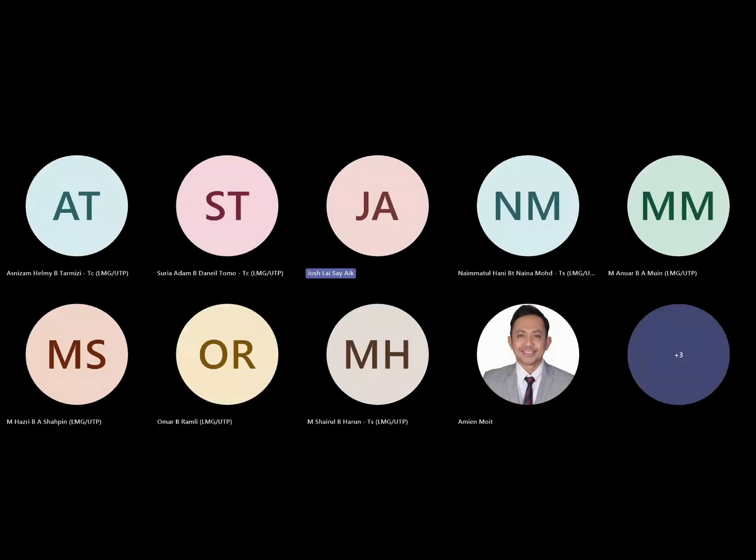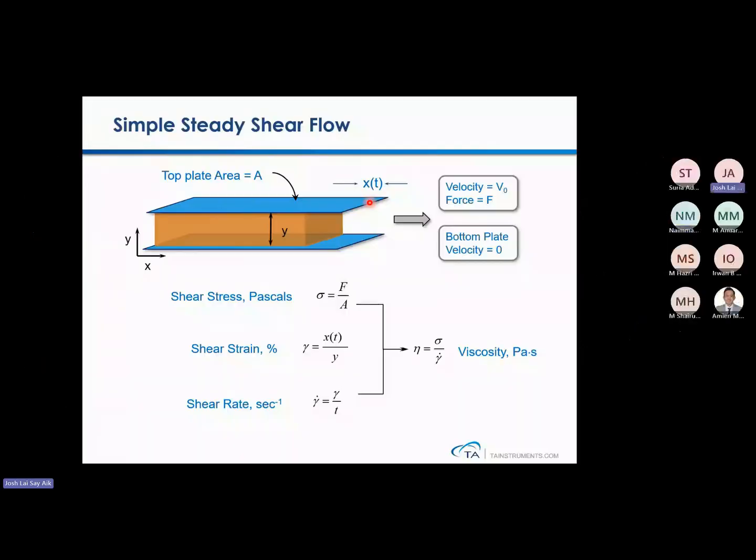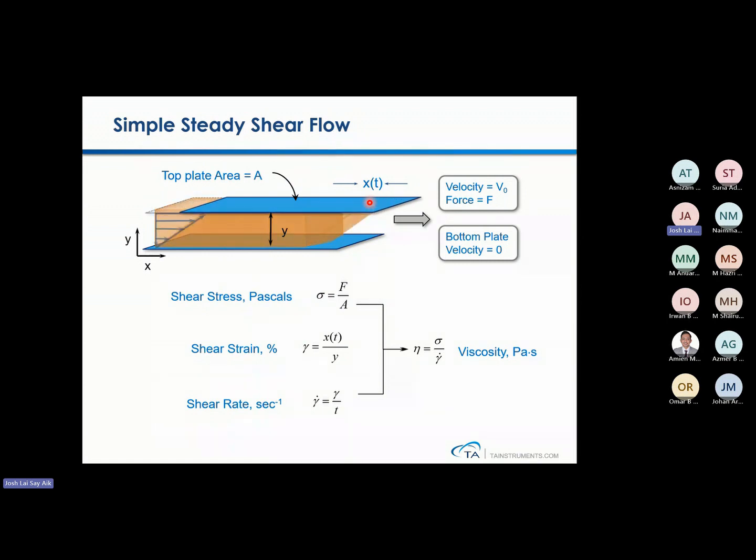If you are an experienced user of rheometers, you always have a very specific geometry size, like 8 mm, 20 mm, 60 mm. So you have a very fixed area at the top plate. When you set up an experiment, the geometry is going to move to displace your sample at a particular preset displacement, depending on the strain percentage or the shear rate that you need.